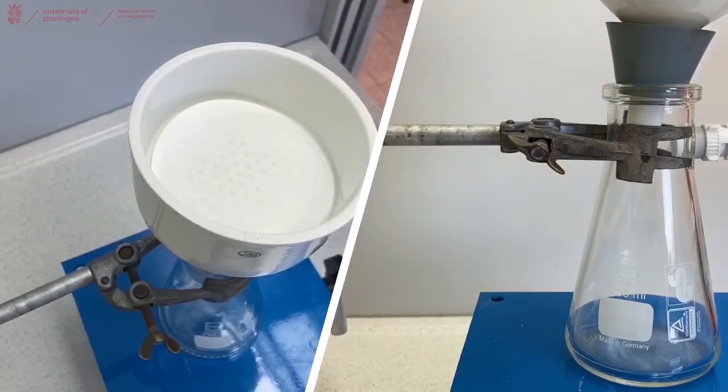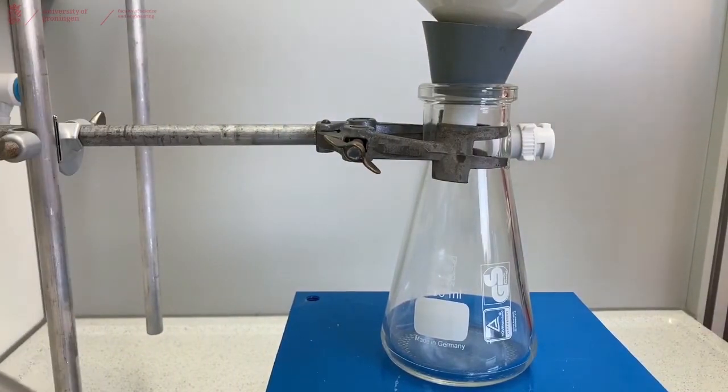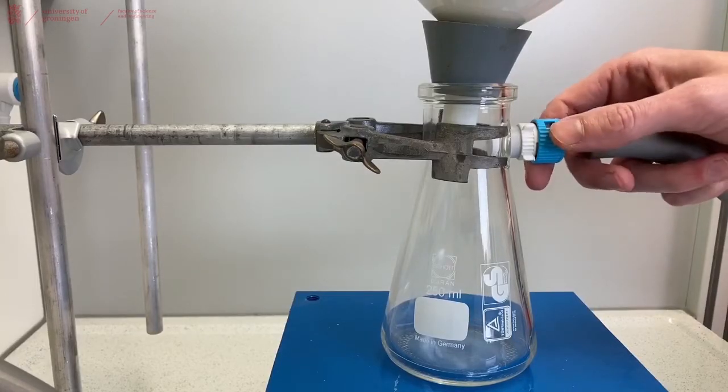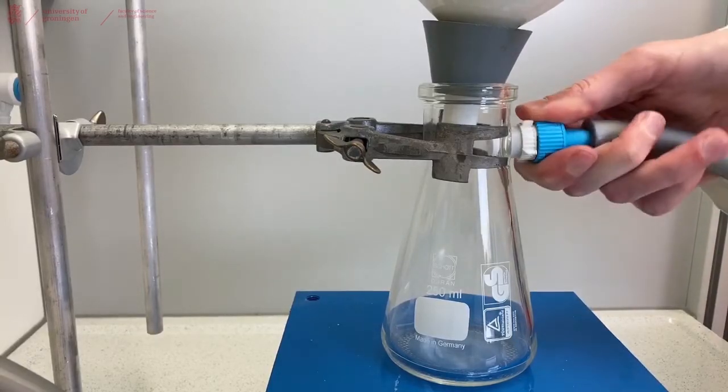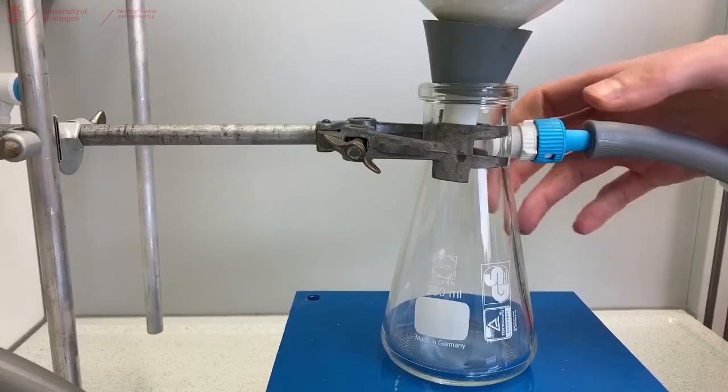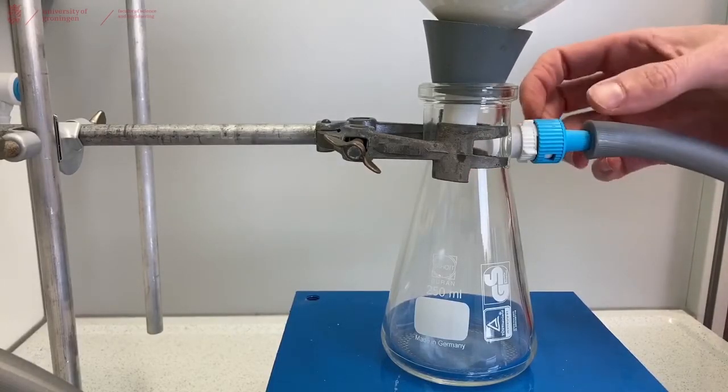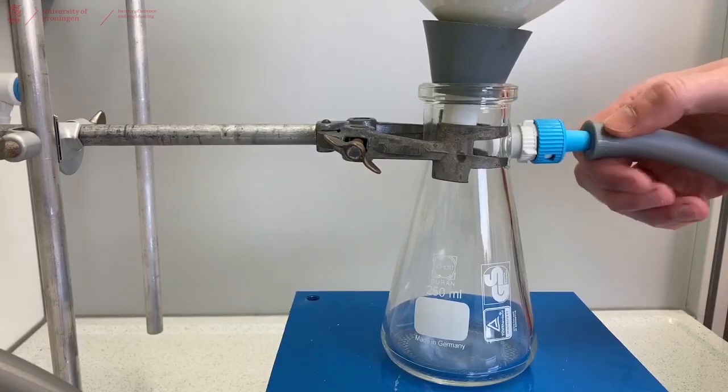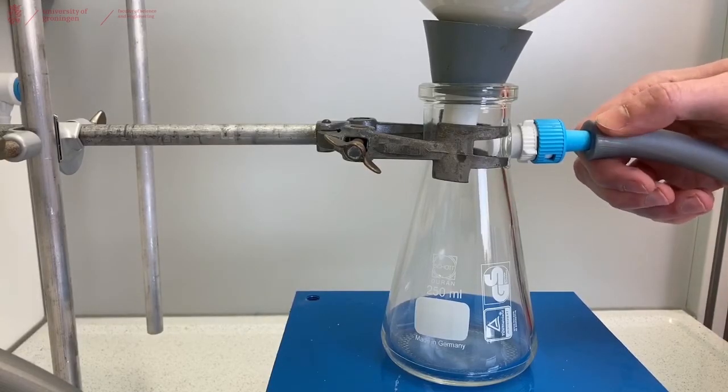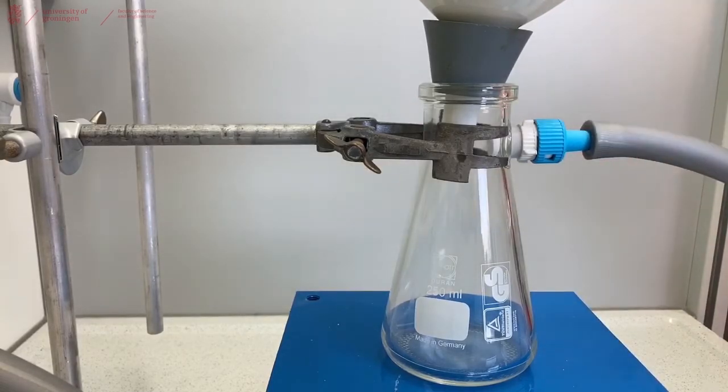Connect the filtration flask to the vacuum. In this case we're using the inline system of this fume hood, but you could also use a vacuum pump that is available in most labs. Make sure it's attached tightly - this one has a screw cap. You can also have ones with an opening where you just push the gray hose inside the filtration flask.